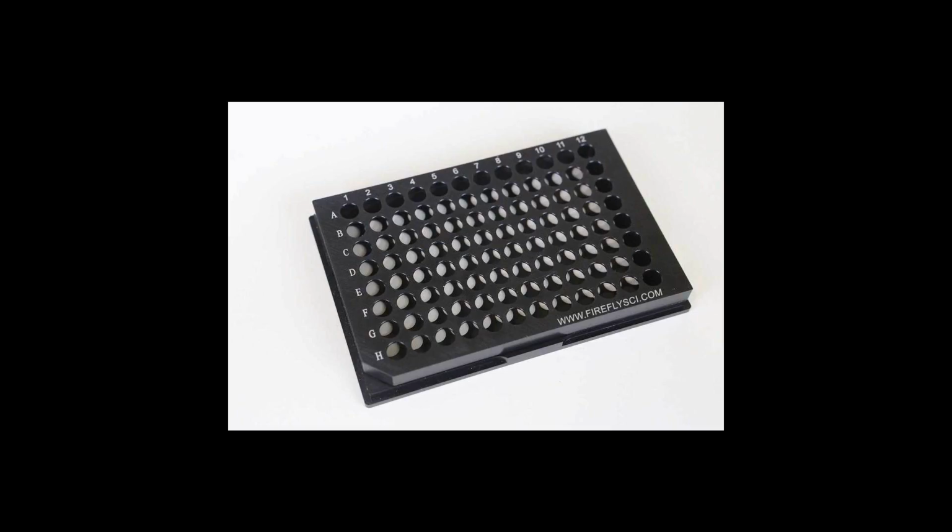Fluorescence intensity detection has developed very broadly in the microplate format over the last 2 decades. The range of applications is much broader than when using absorbance detection, but instrumentation is usually more expensive. In this type of instrumentation, a first optical system, the excitation system, illuminates the sample using a specific wavelength, selected by an optical filter, or a monochromator.